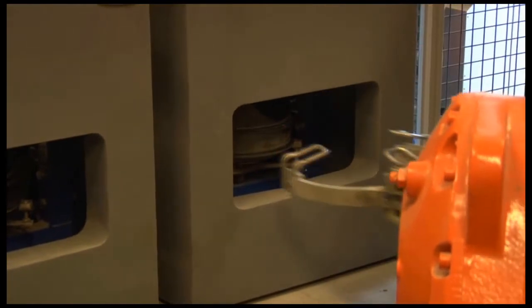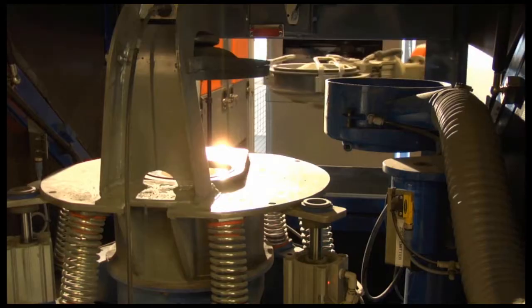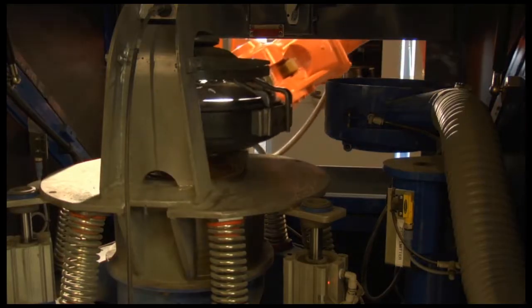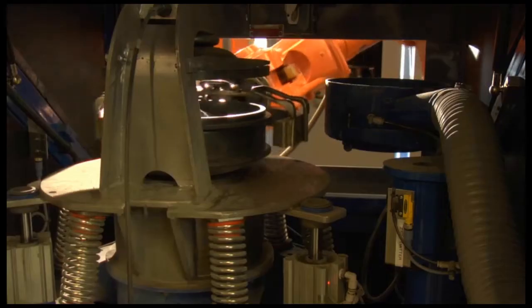From the splitter in the coarse preparation cell, a sample portion is discharged directly into a grinding bowl in the pulverizing cell. Here, it is pulverized in one of the six large-capacity mills.